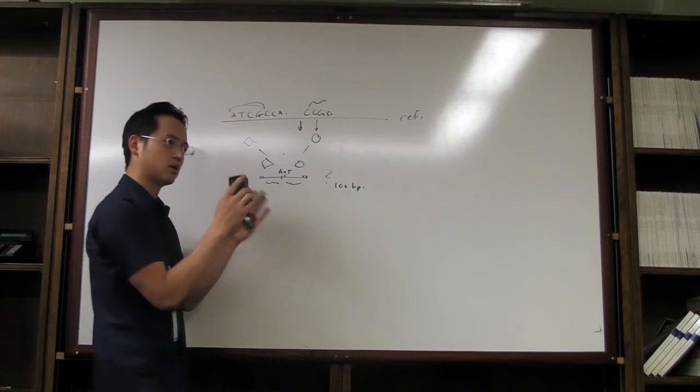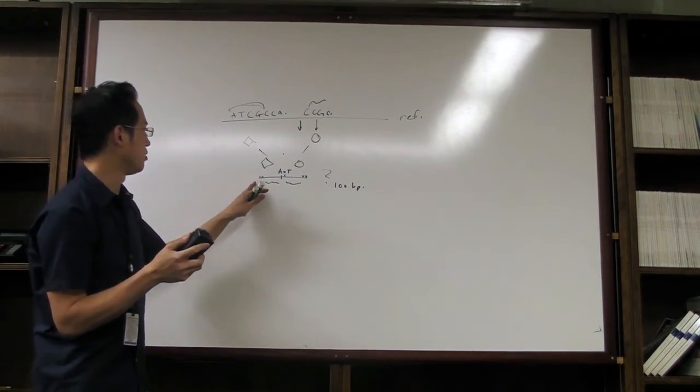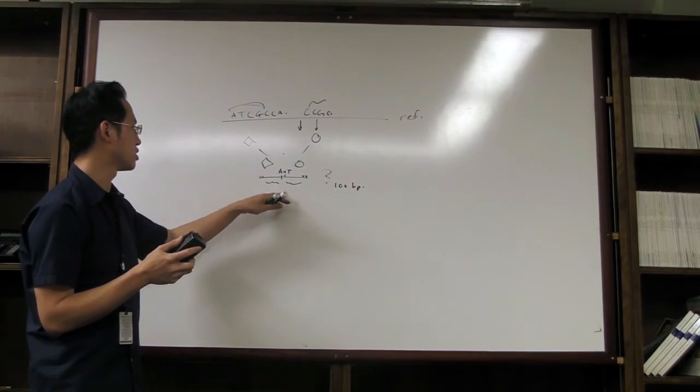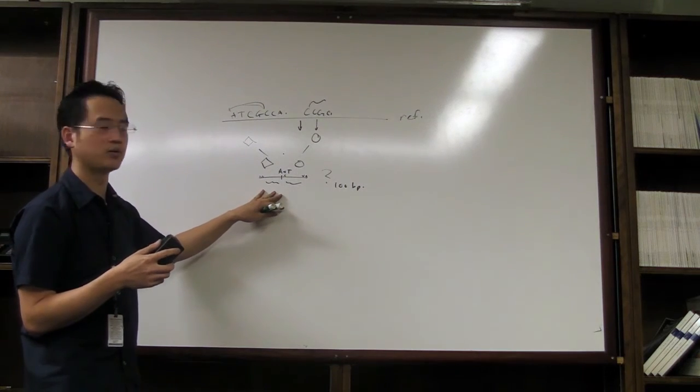and actually the quality scores get figured into here as well. You can say, if you map overall and the average quality is something, please accept it. If not, then throw it away. So there are ways of doing that as well.